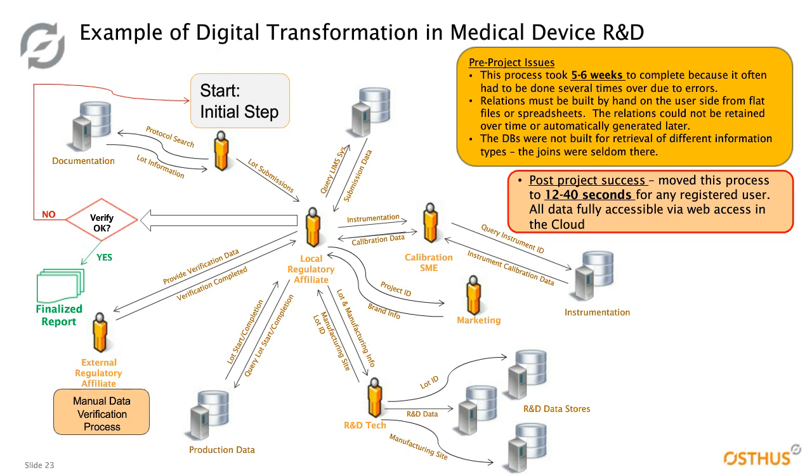And to get this answer back to send off, normally by the time they got it back, it was incomplete. They didn't have everything. Not everyone understood what was supposed to be queried, or the data didn't exist, or it was dirty, or they couldn't find it. And so normally, is it verified? No, they get to go back right to this initial step of protocol search and do it again. This process took 5 to 6 weeks to complete a report for regulatory.